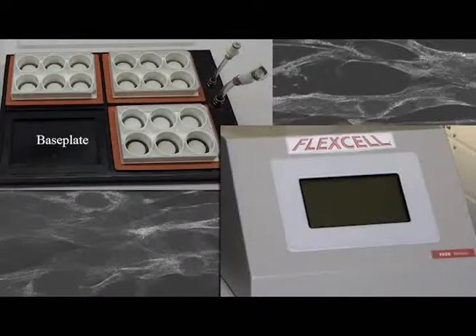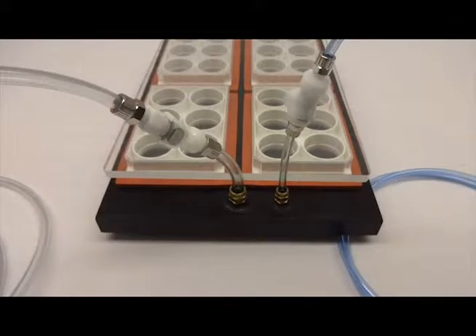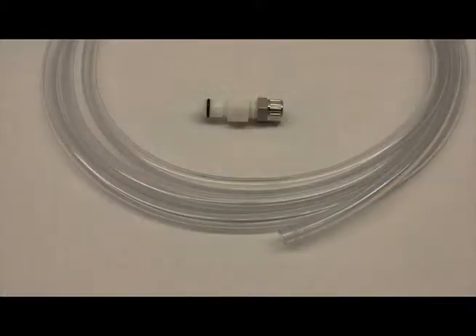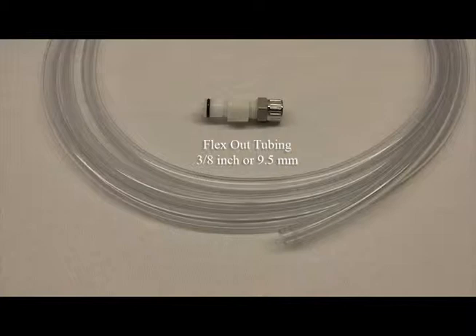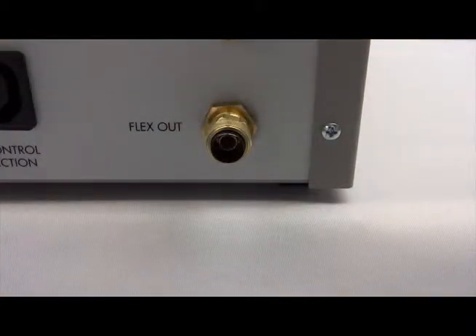To connect your base plate to a flex link, connect the system tubing as follows, remembering to cut the flex in and flex out tubing to the needed length. Connect one end of the clear 3/8 inch or 9.5 millimeter tubing to the flex out port on the back of the flex link.